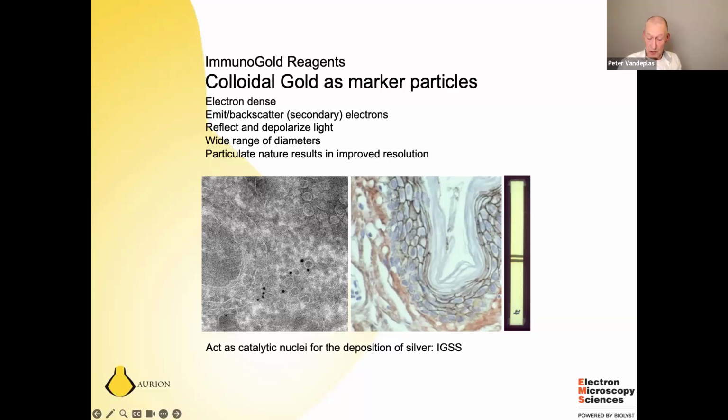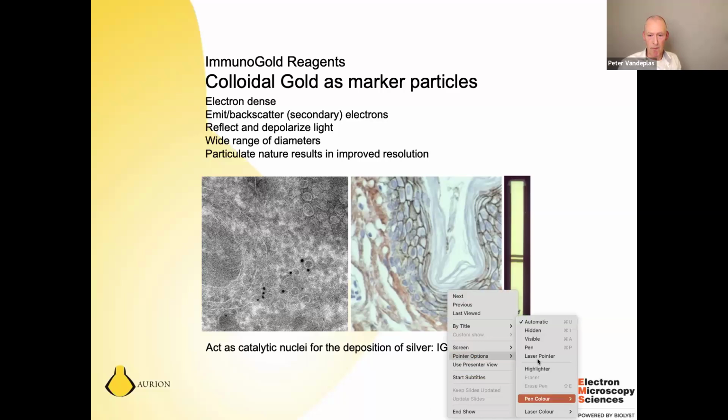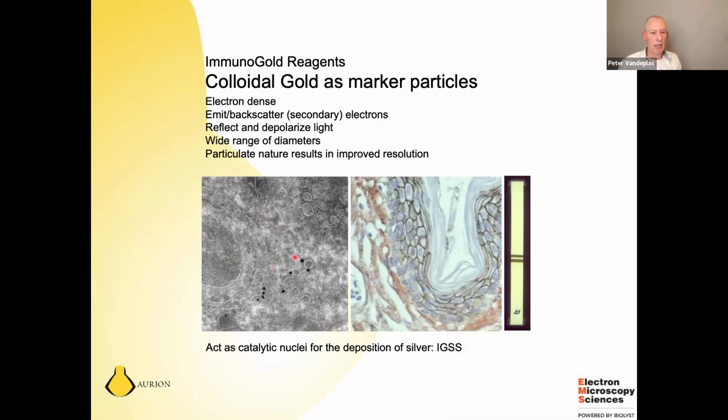So in this slide, you see in the left image a Tokuyasu cryo section. In this section, COP2, a coat protein present on the vesicle membrane, is being demonstrated with a polyclonal antibody against COP2 and visualized with an ultra-small gold nanoparticle conjugated Fab fragment against rabbit IgG, silver enhanced for visualization. So particles are lying very close together to the area where the antigen is located.